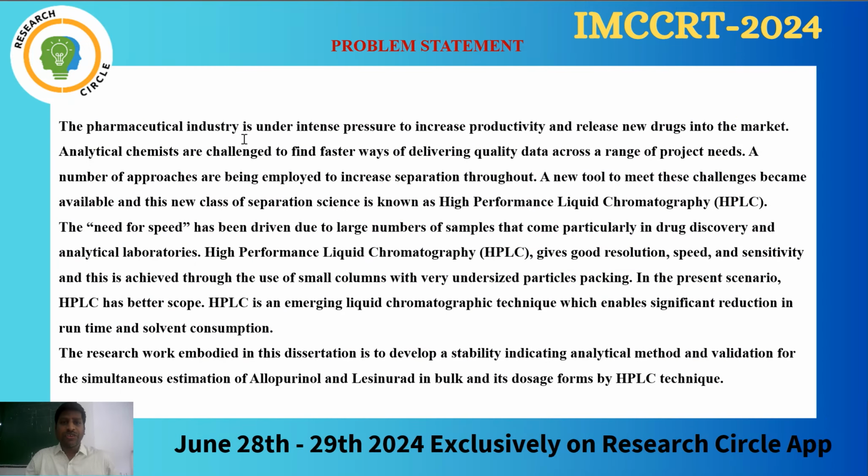The pharmaceutical industry is under intense pressure to increase productivity and release new drugs into the market. Analytical chemists are challenged to find faster ways of delivering quality data across a range of project needs. A number of approaches are being employed to increase separation throughput. A new tool to meet these challenges became available, and this new class of separation science is known as high performance liquid chromatography. The need for speed has been driven by the large number of samples that come particularly in drug discovery and analytical laboratories.